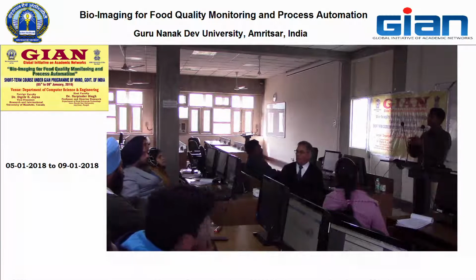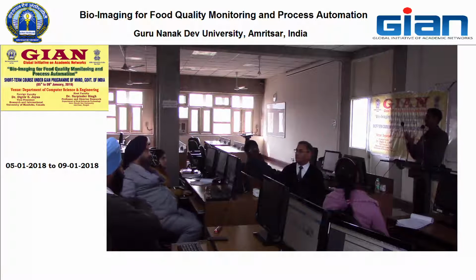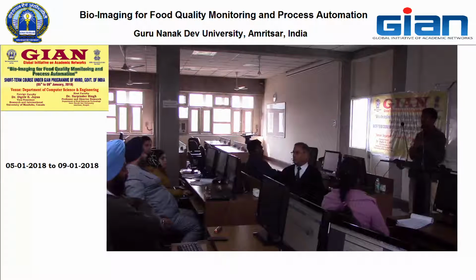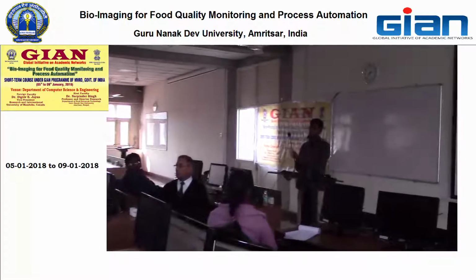Based on your application, if you just want to know the grain size or something, then you just do eroding or filling-up operations based on your need. In our lab, most of the time we take images of bulk kernels or in a petri dish. What we used to do was segment or cut down to only the central portion, like a 100 by 100 image, to do the analysis and avoid errors on the sides.